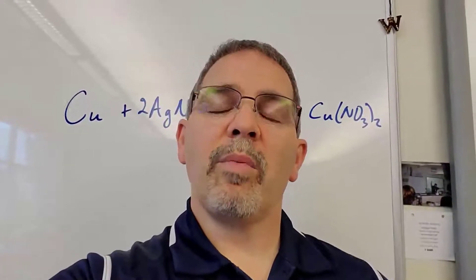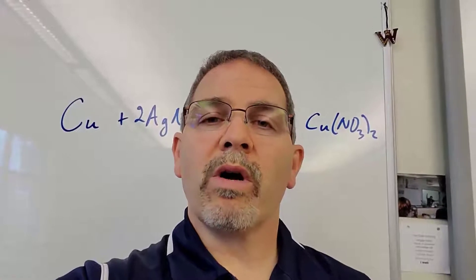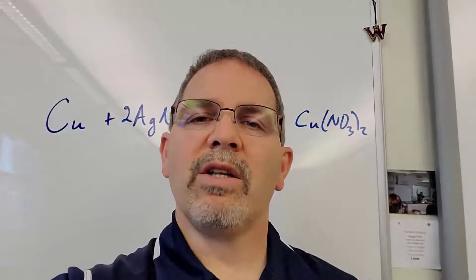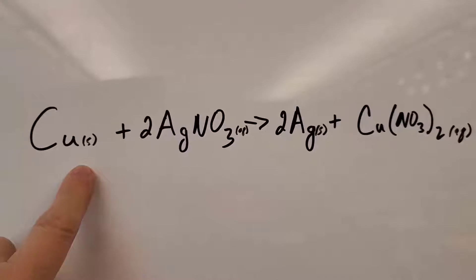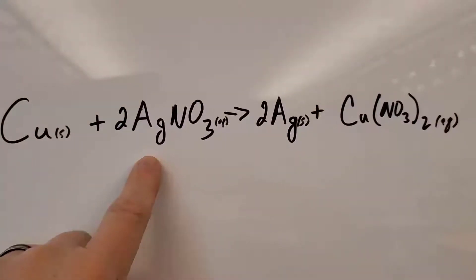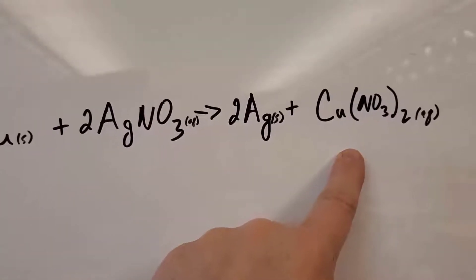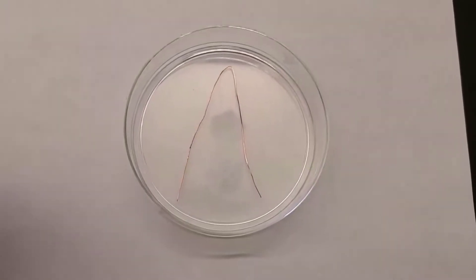We're talking about single replacement reactions. I want to show you a simple one where copper atoms are replacing silver atoms. Here's our reaction: I've got solid copper, I'm gonna pour some silver nitrate solution over the top of it. Solid silver will precipitate out and we'll be left with a solution of copper nitrate. Here's our copper wire.